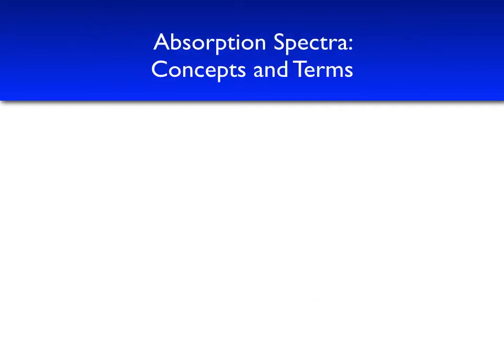Absorption spectra and spectroscopy are things that are not discussed very much in lecture. However, it is such an important tool in chemistry, we do want to cover it in a laboratory where it's more likely used.